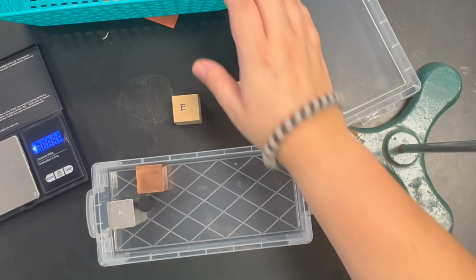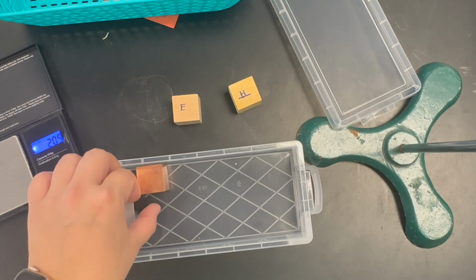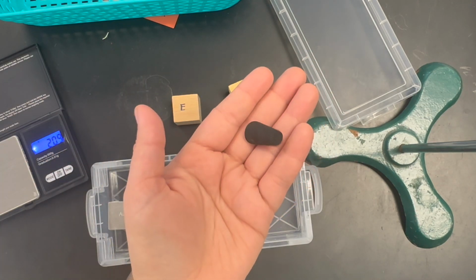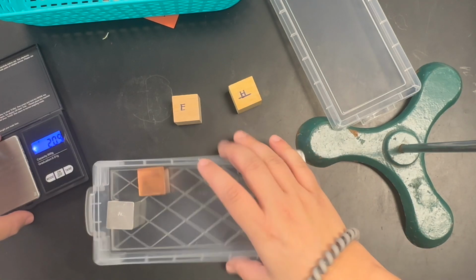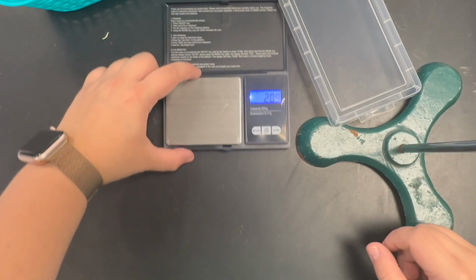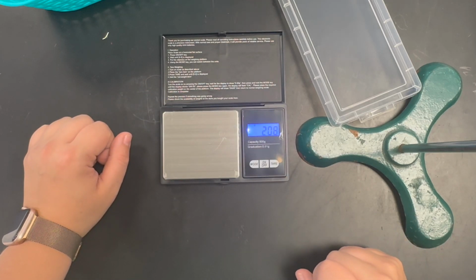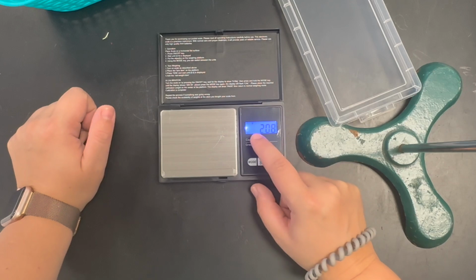Now, part 1 is finding the volume of the weird object with water displacement. So there's no exact formula for volume for this rubber stopper. So what we're going to do is take the mass of it. Sometimes when you turn on the scale, it might have a number, which it shouldn't. It should start at 0.